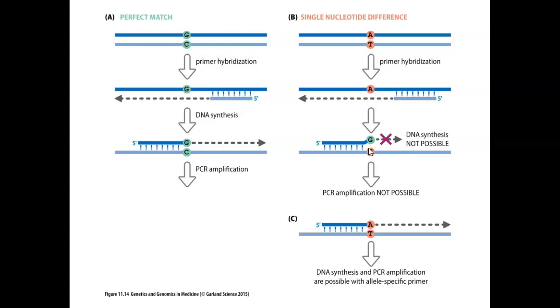If there is a germline or a known substitution that we just know of, for example, sickle cell is always going to have the same substitution, the third step would be done on all these, which is to create a reverse primer. There's your forward primer, there's your reverse, whatever. They really don't mean anything. They're just ways to tell them apart. They will also do another PCR with the incorrect mutant letter at the very end, which would be the A, and therefore it would cause amplification and further evidence that that person has that particular single nucleotide difference.